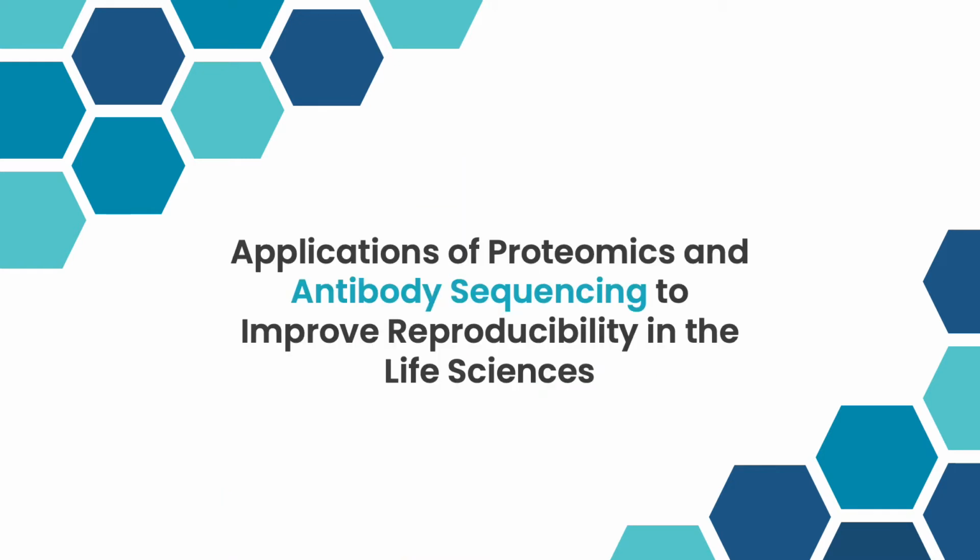And today we're going to be talking about some applications of proteomics, specifically antibody sequencing and how it can act as a tool to improve reproducibility in the life sciences. Today, I'm going to focus on antibodies specifically because of their sheer ubiquity in the life sciences and just how much we rely on them for our day-to-day research. But it's important to note that the same proteomics approaches we discuss can be applied to really any protein to further characterize it.